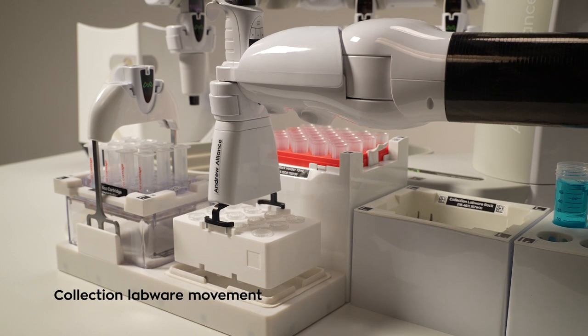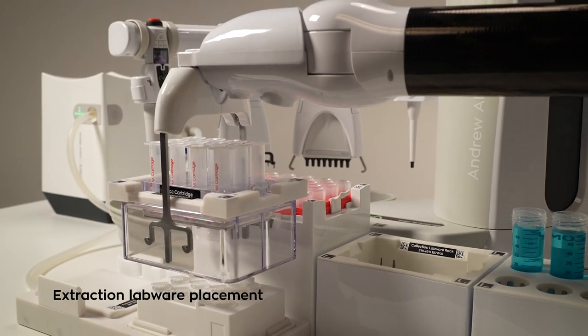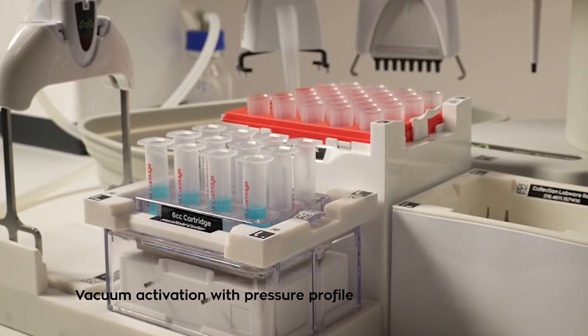In addition to the numerous manual steps for waste and collection labware replacements, it has become crystal clear that fully automating extraction procedures would provide a much better user experience overall while guaranteeing better results. And we now made this possible on the Andrew Plus robot equipped with the Extraction Plus device.